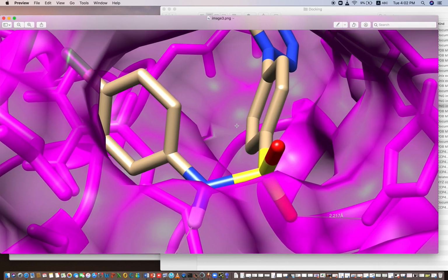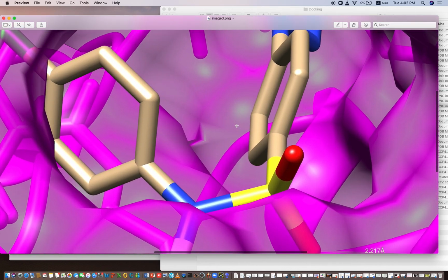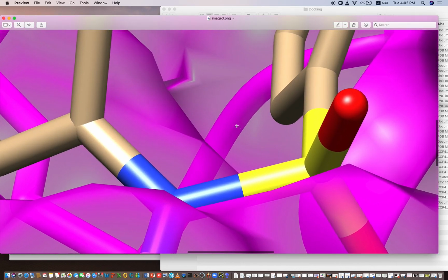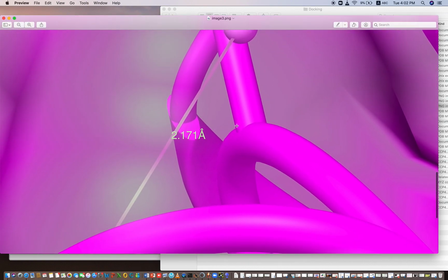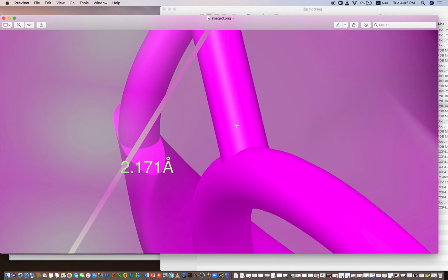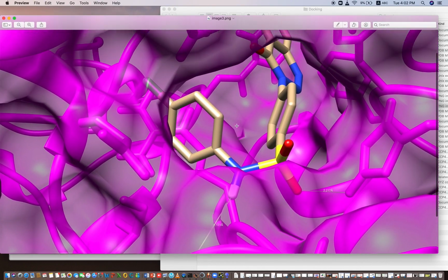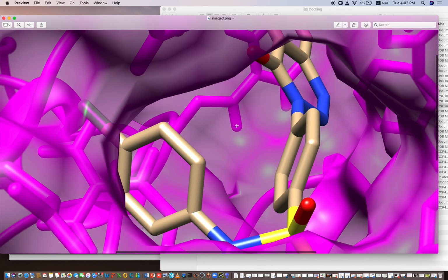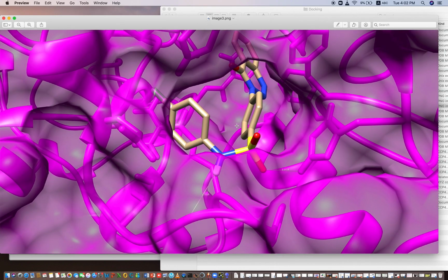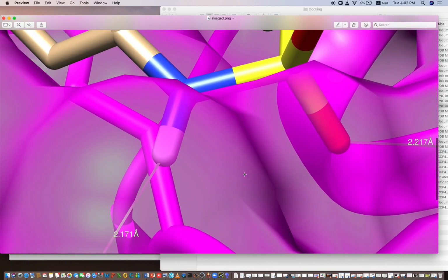Just check the quality while zooming in. There is no problem in the pixels. Very accurate. Oh my goodness, very good picture. Are you looking at how much zoom you are doing?